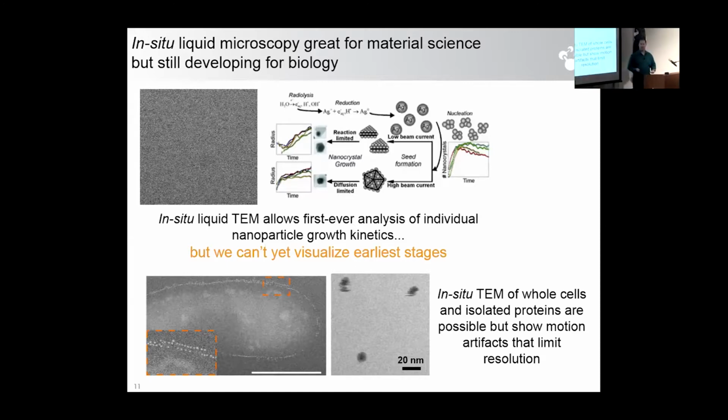And so we have this limitation of not having conventional microscopes that can operate fast enough to look at dynamics for biological organisms yet. Because of that, we've been focused on developing a next generation electron microscope. This one takes a completely optimized electron microscope column and integrates 2 pulsed lasers. The first one can enter just above the sample plane and shine down to trigger a reaction, start a reaction.